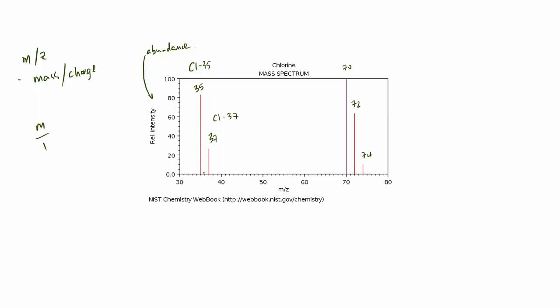These 3 are different, and you may already be able to work out where these are coming from, but these 3 are as a result of the chlorine molecule. Now, in your exam, it's difficult. I couldn't find any on the NIST website for individual atoms. A lot of what's on there is all based around molecules and isotopes and molecular spectra. I wanted more atomic ones, but I couldn't really find them. But there we go. So what we've got here is actually the Cl2 molecule, charged.